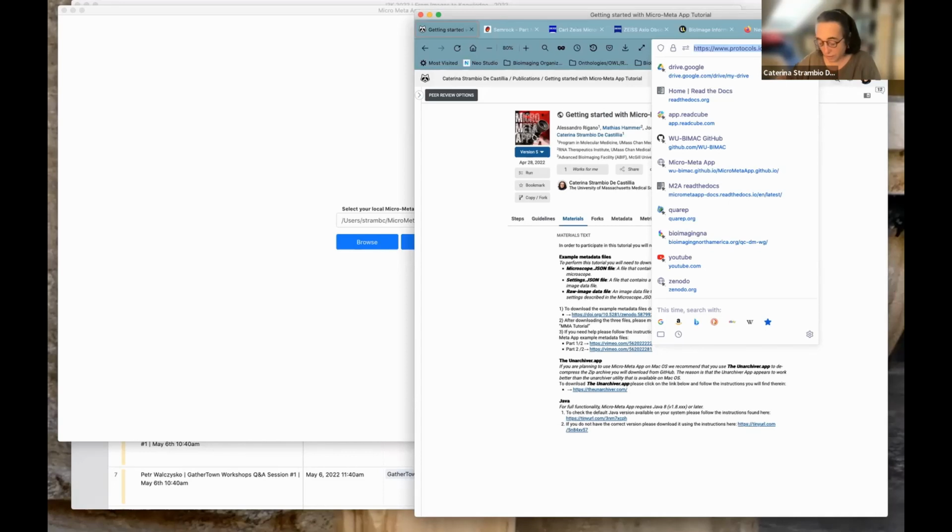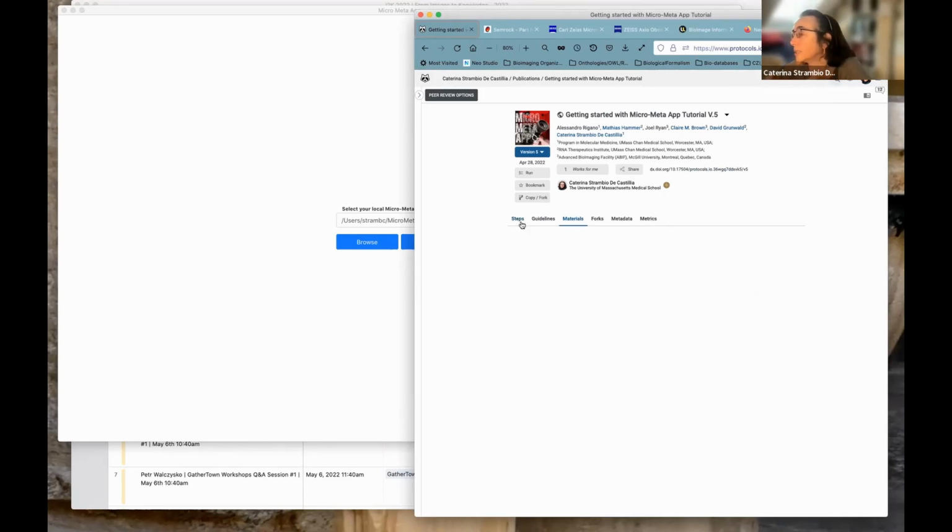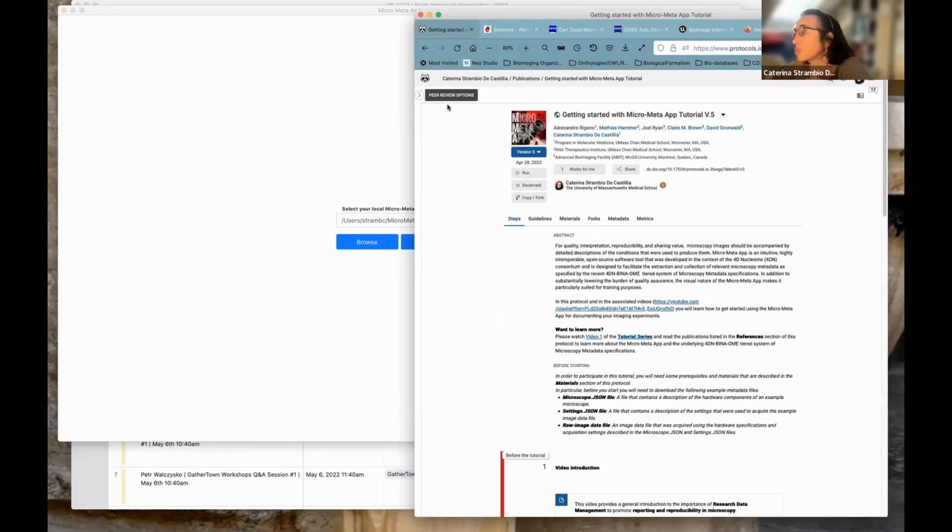I hope you have received the link to this protocols.io file. This protocols.io file contains instructions and a lot of material, step-by-step instructions that are complementary to the video that you can watch and this live demo.